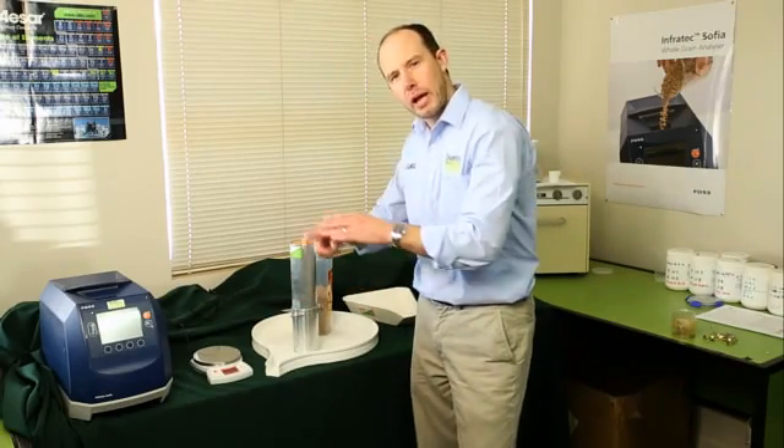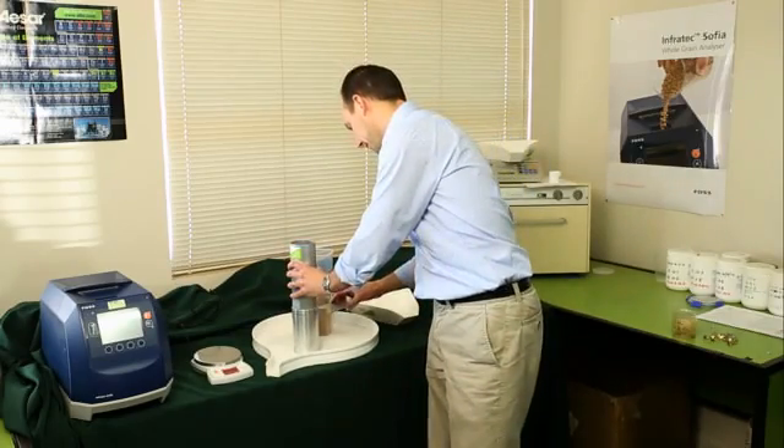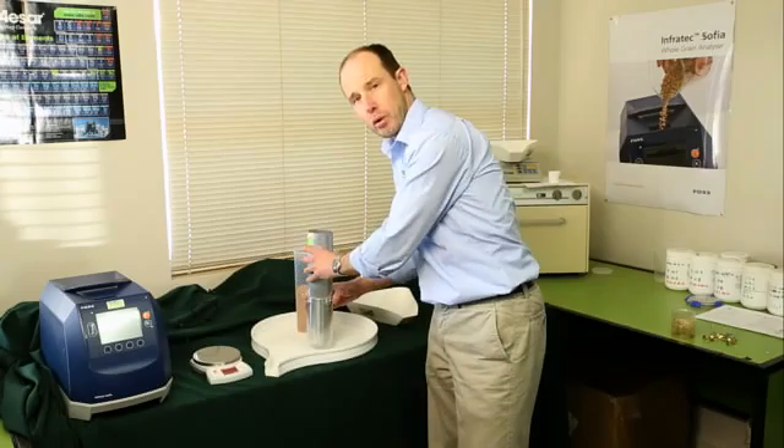I'm going to pull the cutter bar out, but when you pull it out, make sure you do it swiftly. Then you can place the cutter bar again and cut it off. Pour out the excess grain.